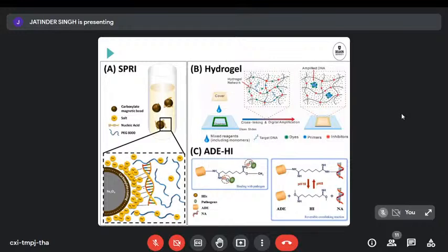If we then change the chemical conditions, we can change the preference of the sodium ions to actually be situated on the carboxylated or the negatively charged coating. It's carboxylated, it's still the negative charge. If we change the chemistry, these sodium ions don't want to be that close to the surface anymore. So the attractive force for the DNA is disappearing and our DNA is being released.